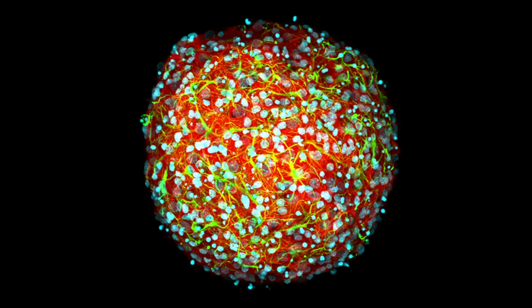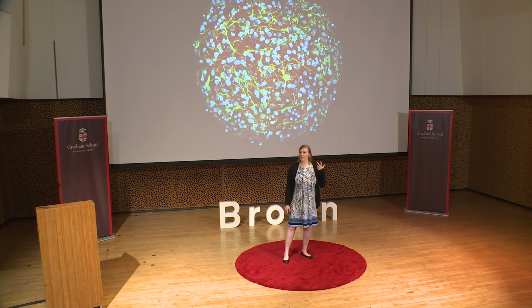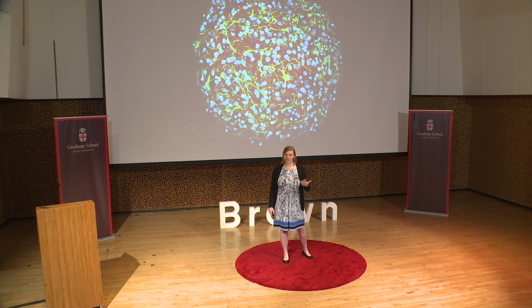In the Hoffman Kim lab, we have developed a 3D brain microtissue model, colloquially known as a mini brain. These mini brains are tiny, about the width of a tip of a mechanical pencil, barely visible to the naked eye, and yet they replicate many of the aspects of an actual brain. They have the same cell types as a brain, the neurons communicate with each other as they would in the brain, and they have many of the same physical properties, including tissue stiffness and cell density.